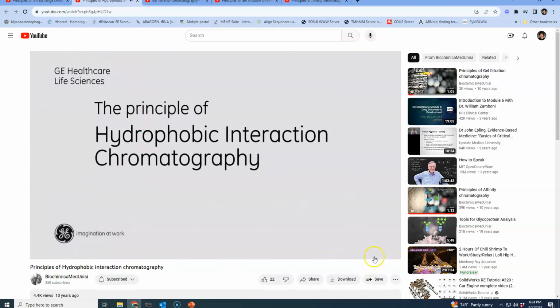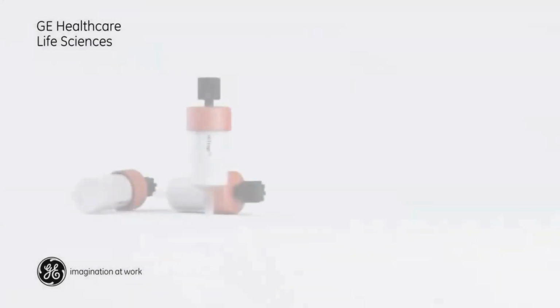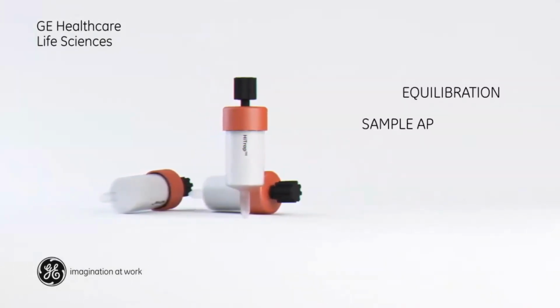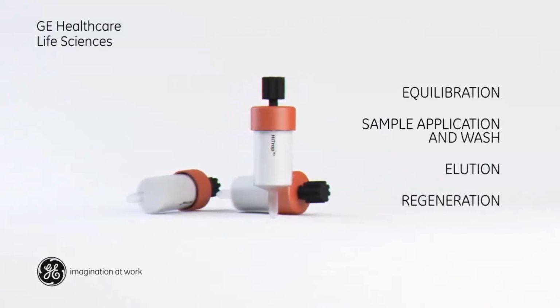Separation in hydrophobic interaction chromatography depends upon the reversible adsorption of biomolecules according to their hydrophobicity. Most hydrophobic interaction chromatography experiments are performed in 4 main stages: equilibration, sample application and wash, elution, and regeneration.